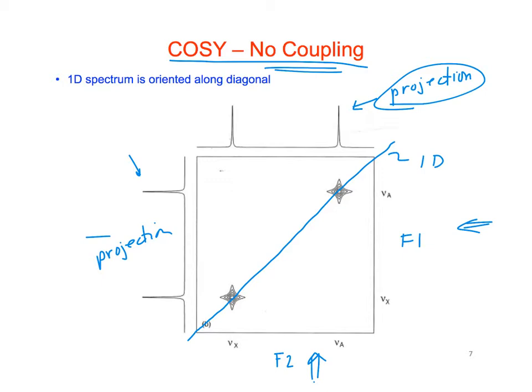We talked about before, if we did a one-dimensional proton experiment, we might sample 16K or 32K of points, and those points are outlining the peaks. But in a two-dimensional experiment, I don't know what they do now on the instruments down here, but probably only like 2K of points or something like that. So the peaks are not sampled as much because you have to deal with 2 dimensions of data.